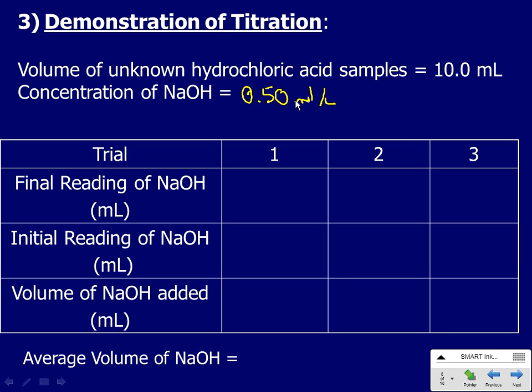And because I'm using base, when I refill, I'm not going to be diluting it. If I had water in here, then I would dilute the base, and I wouldn't know its concentration anymore. I do that 3 times, about 15, 20 mils, doesn't matter. Again, let it come to the end, rotate, rotate, rotate, let that go in there. I didn't let any go through the tip this time. I should maybe do that. So put a little bit in here, number 3.